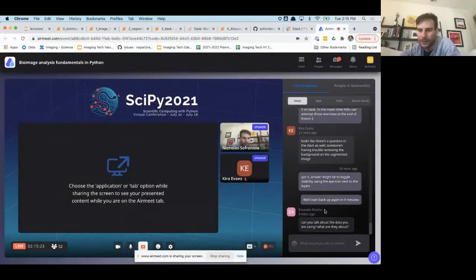Can you talk about the data you're using? What are they? Yeah. So that data was from a cell tracking competition. It was a C. elegans embryo, a little worm that was dividing, and it's nice because you get to see the cells in 3D and a time series, and volumetric time series is becoming more and more common in the imaging and microscopy world. So that was it.